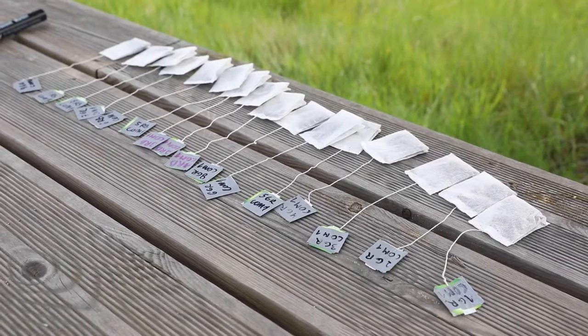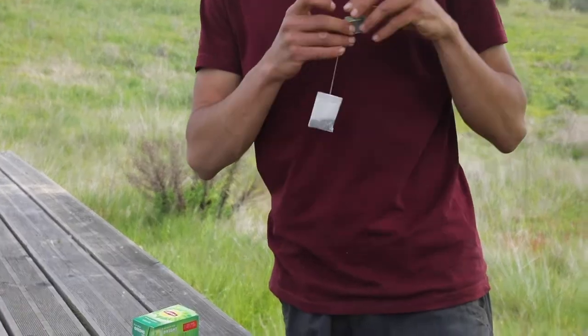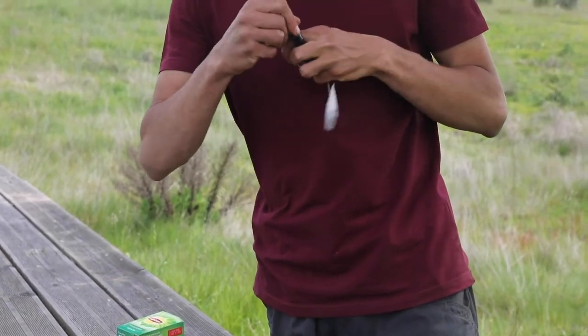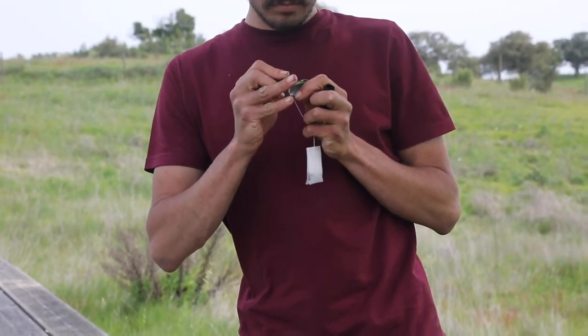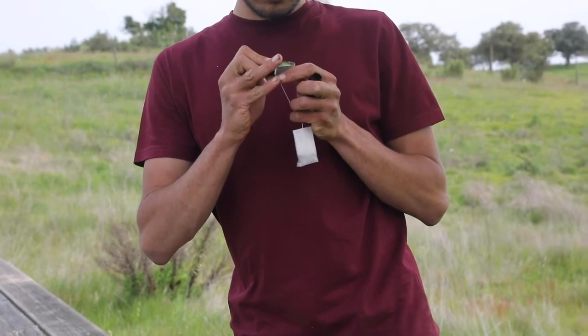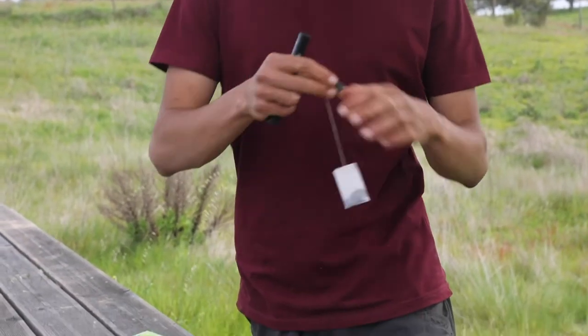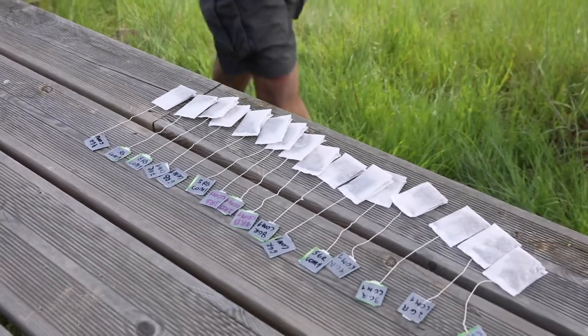Label the tea bags with a unique code that represents the number of the tea bag, the type of tea, the zone you are studying, and the sampling area — either one or two. For example, you could name it 2GRCOM1. To make sure the labels don't disappear, we recommend using tape and noting the codes on top of the tape.